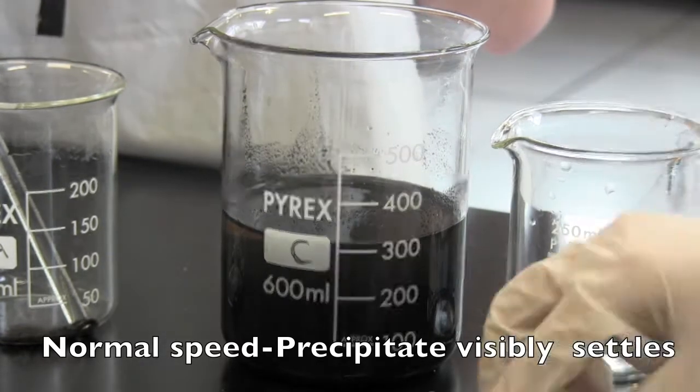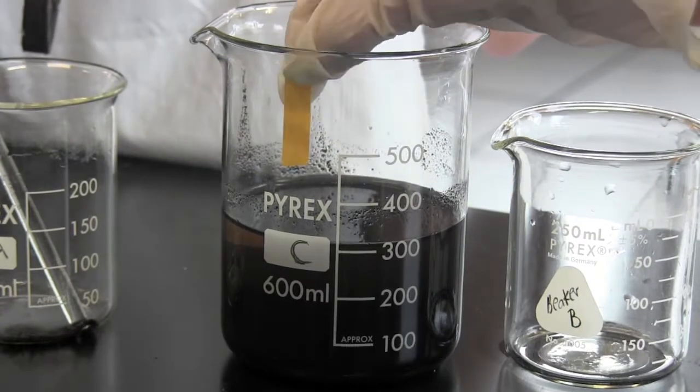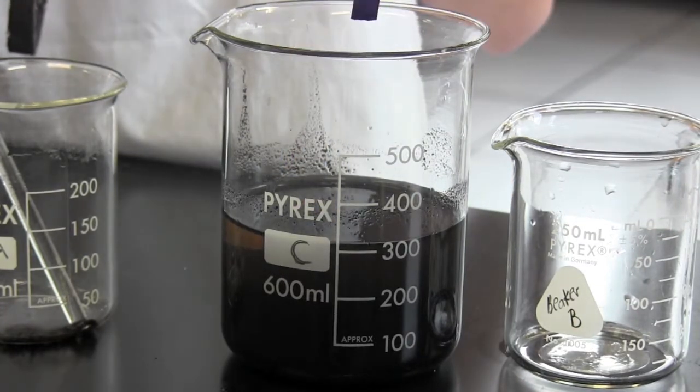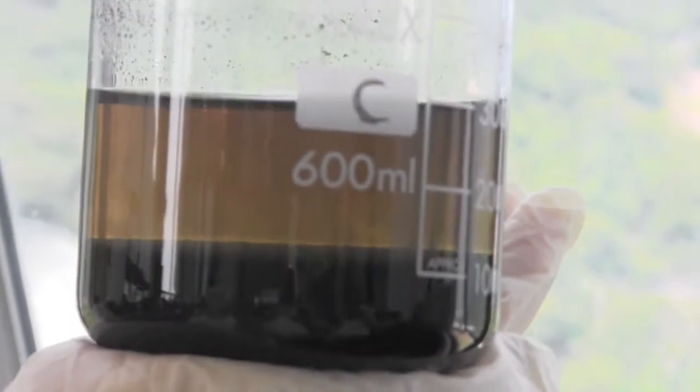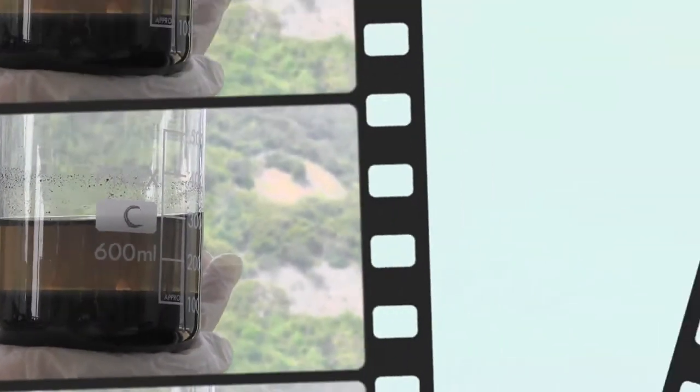We tested the pH of the solution in beaker C, and while we were testing it, it was obvious that the precipitate was settling to the bottom. All the precipitate settled to the bottom after 5 minutes.